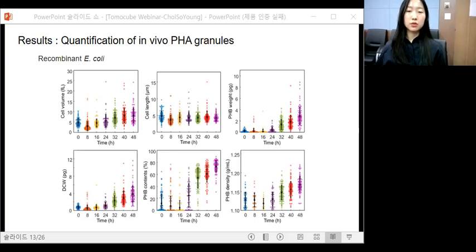Also, for the E. coli cells, the quantification was done like this. From the individual cell data obtained, we performed the correlative analysis to examine the distinctive features of individual cells and PHA granules.